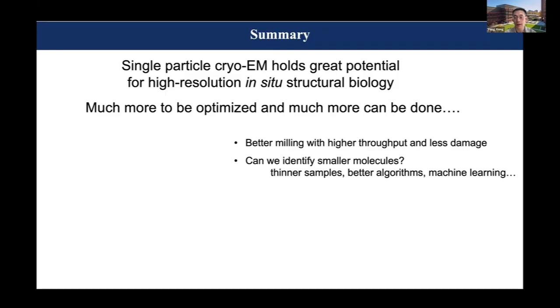There are a lot of ways to optimize the methods. Start with the physical sample to get better signal to noise ratio, that's the first thing. Now, of course, there's the computational algorithm, how you detect better using machine learning approaches to detect the smaller molecules. So there's still a long way to go to achieve that, but I think it's quite hopeful.